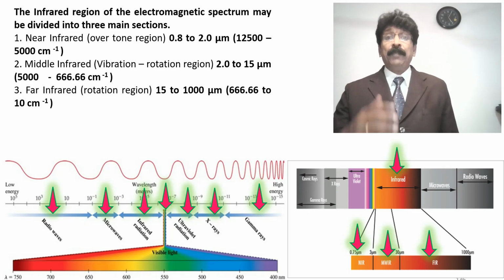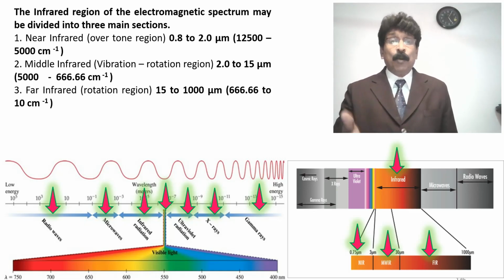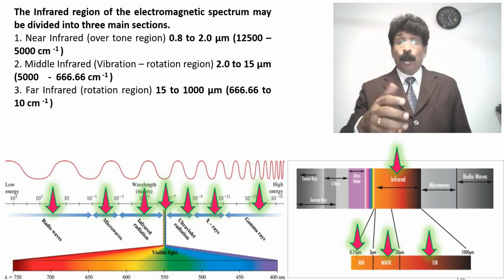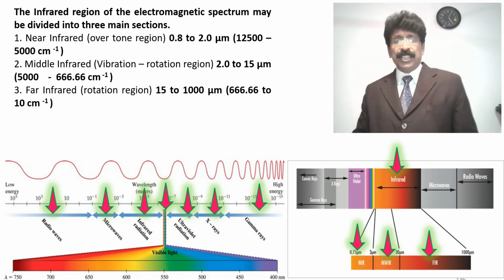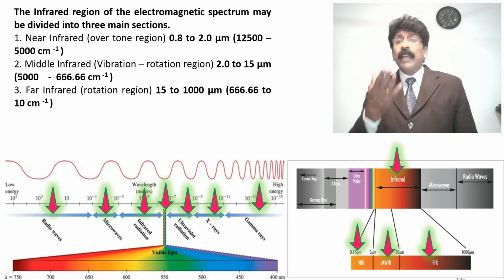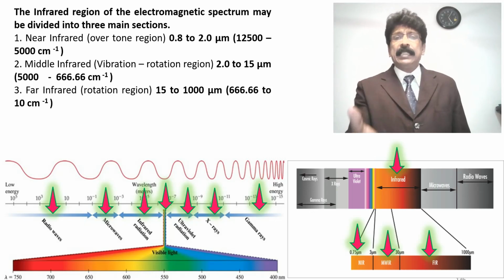Yesterday when we were talking about UV, when light falls on the organic molecule it gets excited, and we have seen about the auxochrome, which supports the chromophore of a conjugated double bond system, which gives the absorption of UV light. Here, in this IR spectrum, the student should clearly understand, very easy, simple.